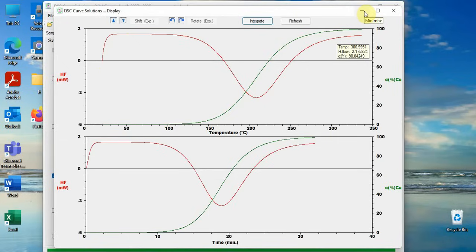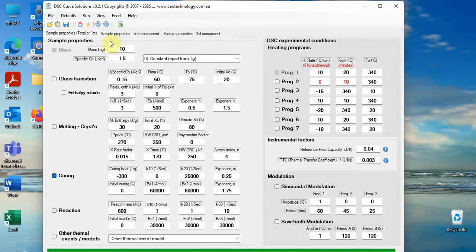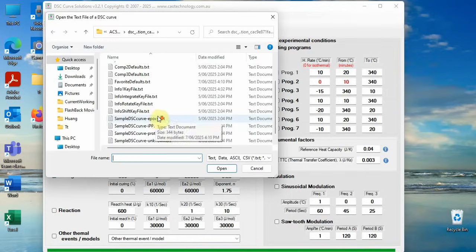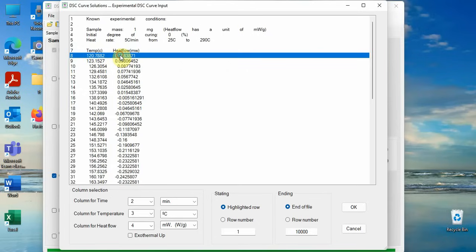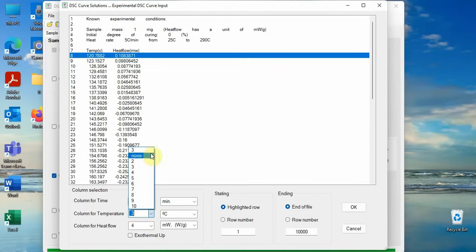Now we see how to determine non-isothermal parameters from actual DSC curves. We first need to input your experimental DSC curve to DCS. Open a data file. Sample mass and the DSC conditions are included in the file. This file does not have time. Column two is for temperature and column three for heat flow.